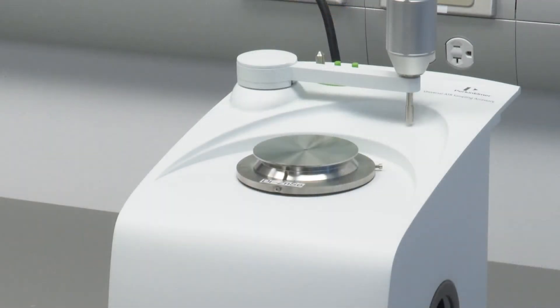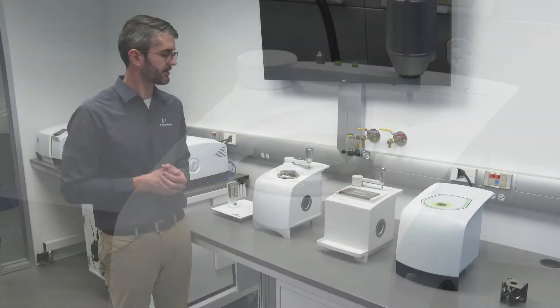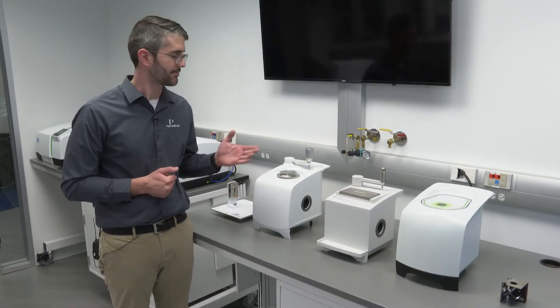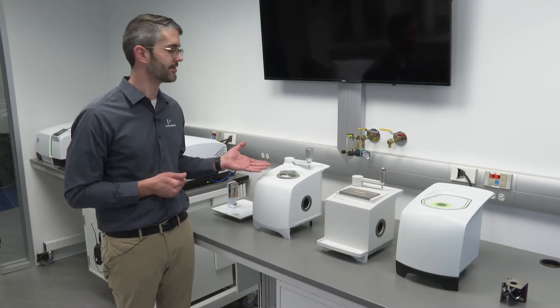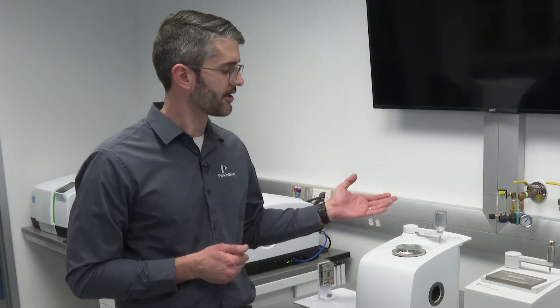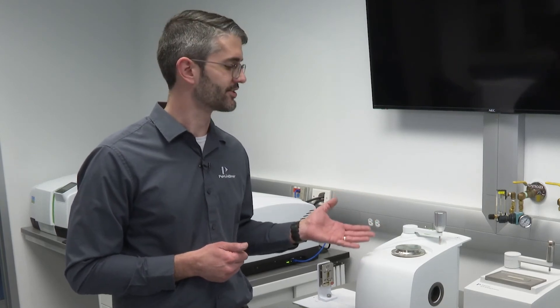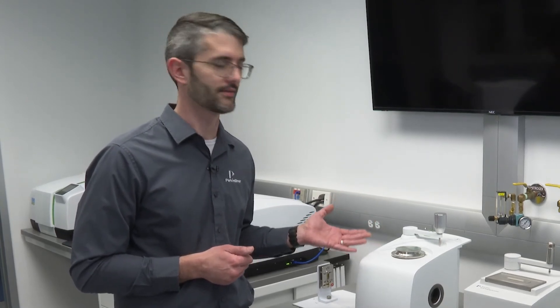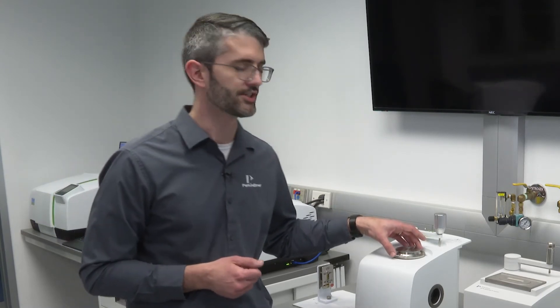In some instances, the single-reflection ATR top plate simply doesn't provide enough sensitivity for the sample or the parameter of interest. In those instances, a multiple-reflection top plate may be used on a sampling accessory like this. PerkinElmer offers one reflection, three reflection, and nine reflection top plates, which allow the user to change the sensitivity of their ATR measurement.